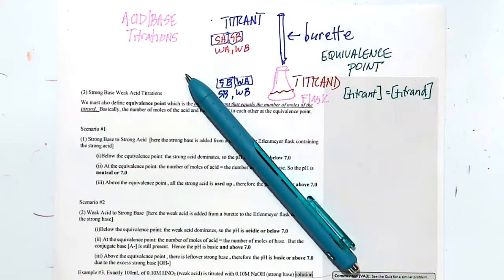I'm going to add a little dye here. Okay, this is an indicator. It's called phenolphthalein, and it's just an indicator. Okay, it's going to change color when the reaction is complete. Okay, that's all it is. Otherwise, you see this is colorless, and this, my titrant, is also colorless. How am I supposed to know when the reaction is done or not? So we add a little dye, also known as an indicator. So I'll add 2 drops. That's all you need.